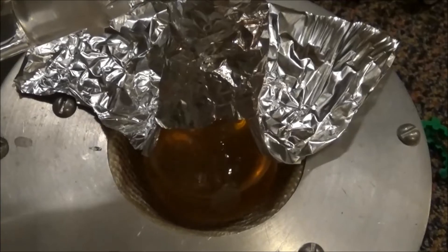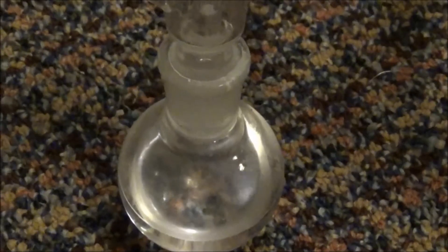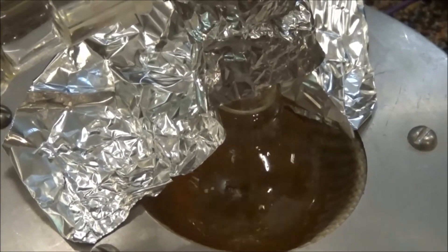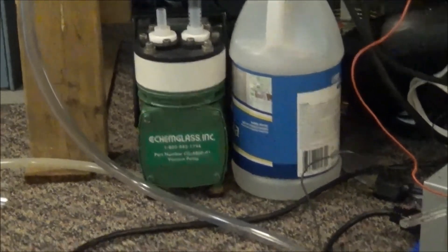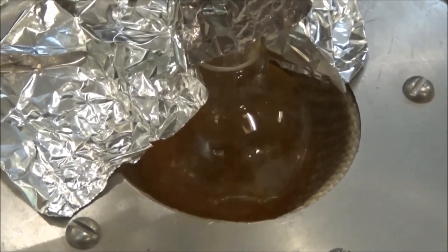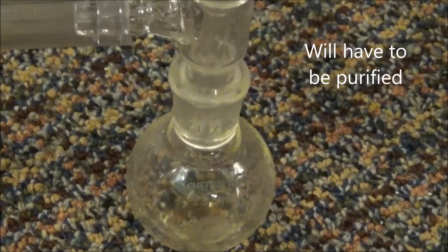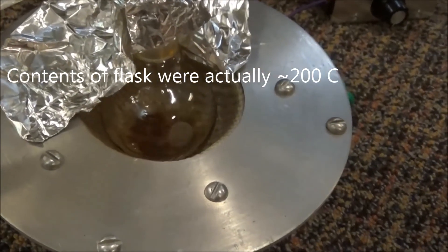I set up for distillation and started by distilling off the ethyl acetate. Once all of the ethyl acetate came off, I applied vacuum and started distilling the mixture under vacuum. At a vacuum of about 30 torr, ethyl benzoate came over at about 90 Celsius. Unused acetophenone also came over. The mixture boiled very violently and was very close to, but did not splash over into the receiving vessel. I ended up recovering about 90% of the unused ethyl benzoate. Eventually the flask reached about 150 Celsius and nothing else was coming over, so I took it off heat and allowed it to cool.